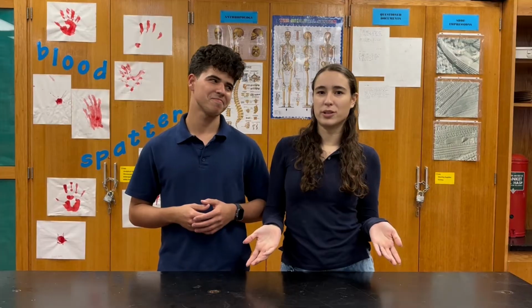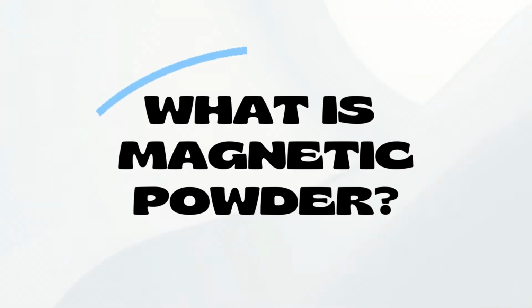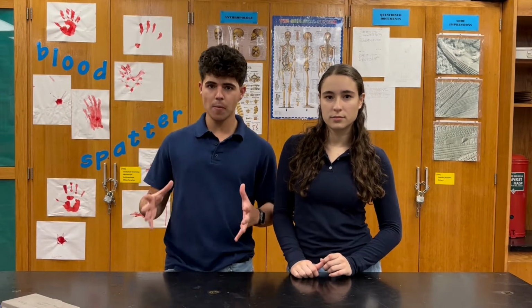Yes, but today we'll be focusing on magnetic powder. So first of all, what is magnetic powder? Magnetic powder is mainly made of granulated iron. This is like getting a huge chunk of metal and putting it into a machine that makes it a powder through a grinding process. The powder itself is simply made out of iron.